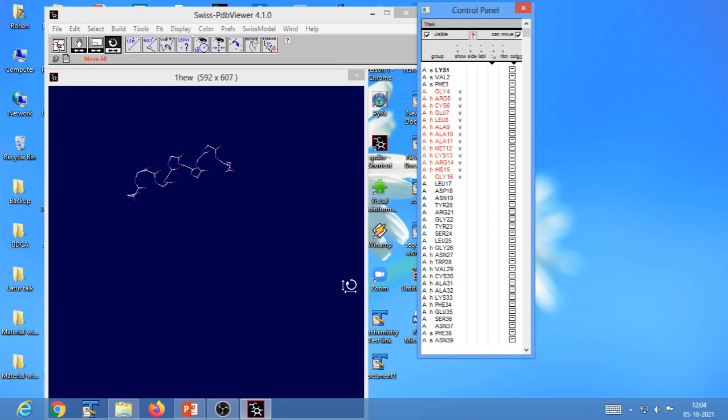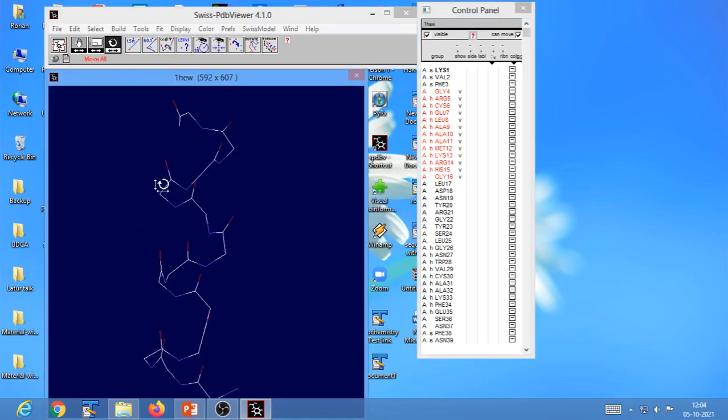Now there is one more trick that I would like to share with you. The next task I would like to show is that there is a difference between selecting and showing. Our next task is that we would select and show residues 4 through 16 with their side chains, and add residues 17 through 22 as follows.